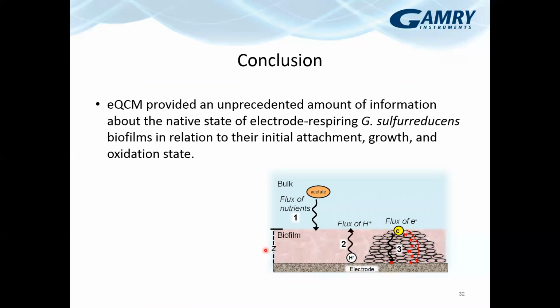So in conclusion, I'll leave you with this, given the limited amount of time: EQCM really can provide you, if you're studying EABs, a lot of information. And this is just basic QCM, and basic QCM, compared to a lot of the other equipment that you can buy, is relatively inexpensive. And if you do it right and you have a setup like the one I've described to you, you can study very accurate, or I would say clean, electrochemistry along with the biofilm formation, and get at how biofilm accumulates on the surface.